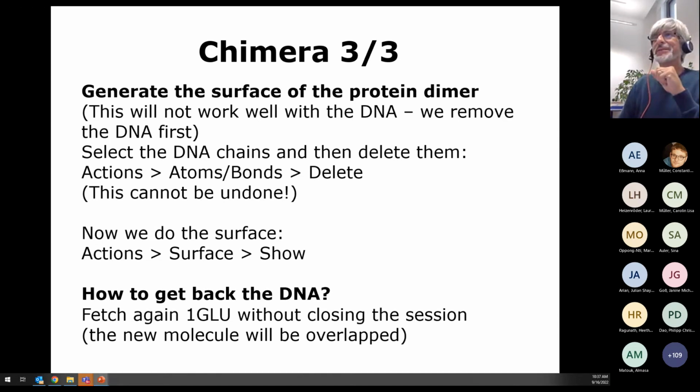This is the beauty of teaching, that you get lots of interesting suggestions. I'm going to try to make the surface go away again and see if it works then, or maybe the DNA is just further away than 5 angstrom. I don't think so. I think it should be in contact. I also thought it must be in contact, but it didn't highlight anything.